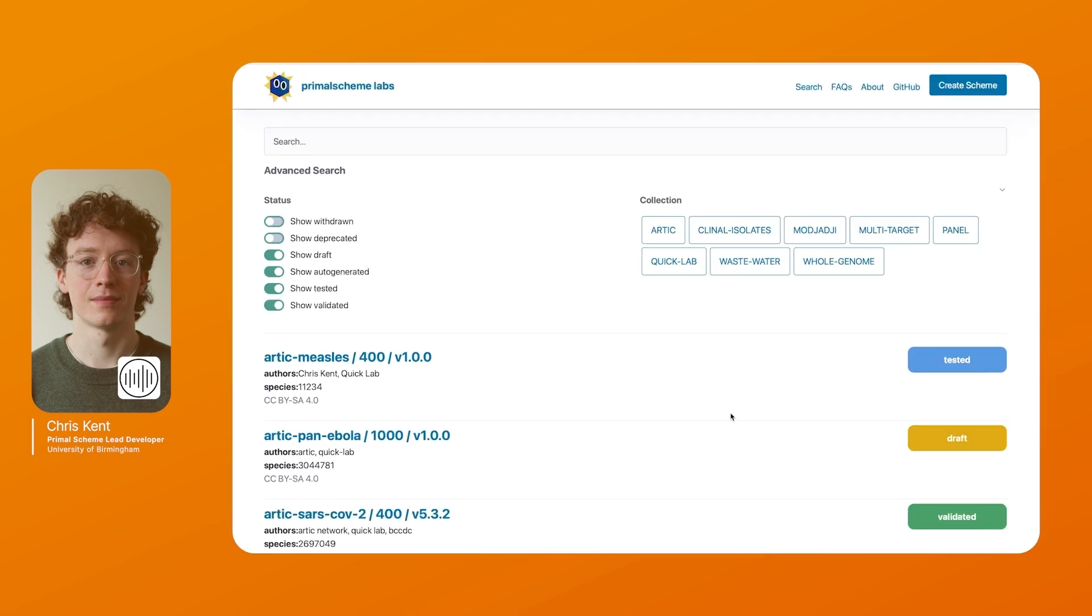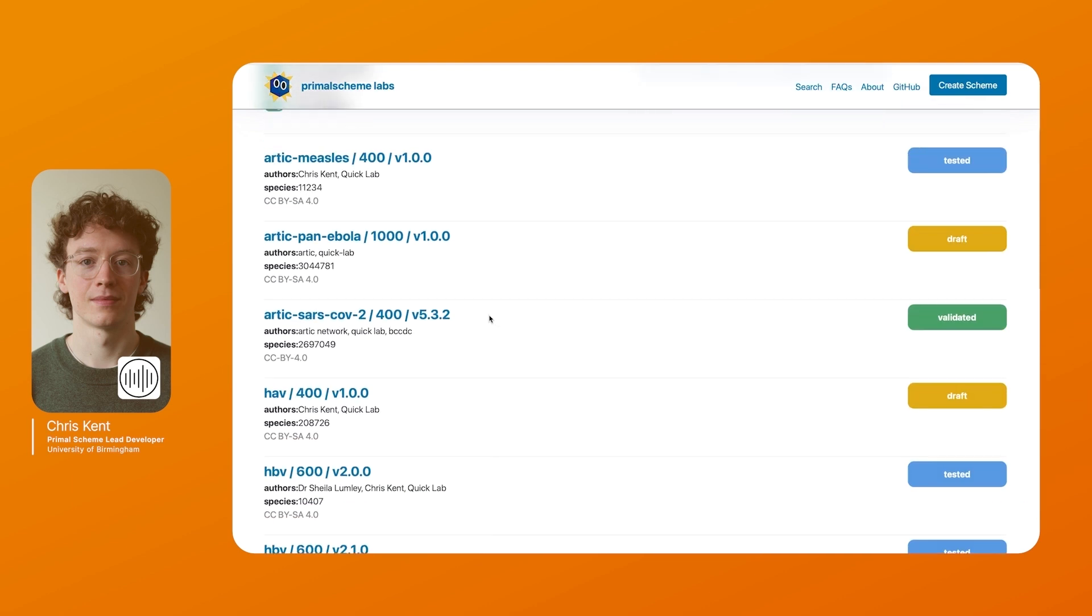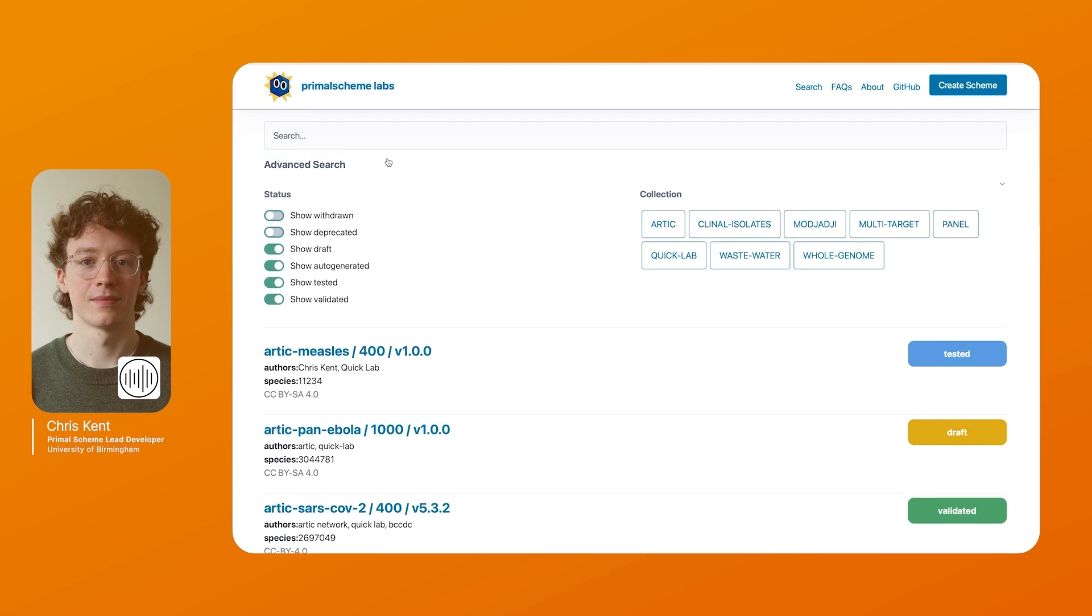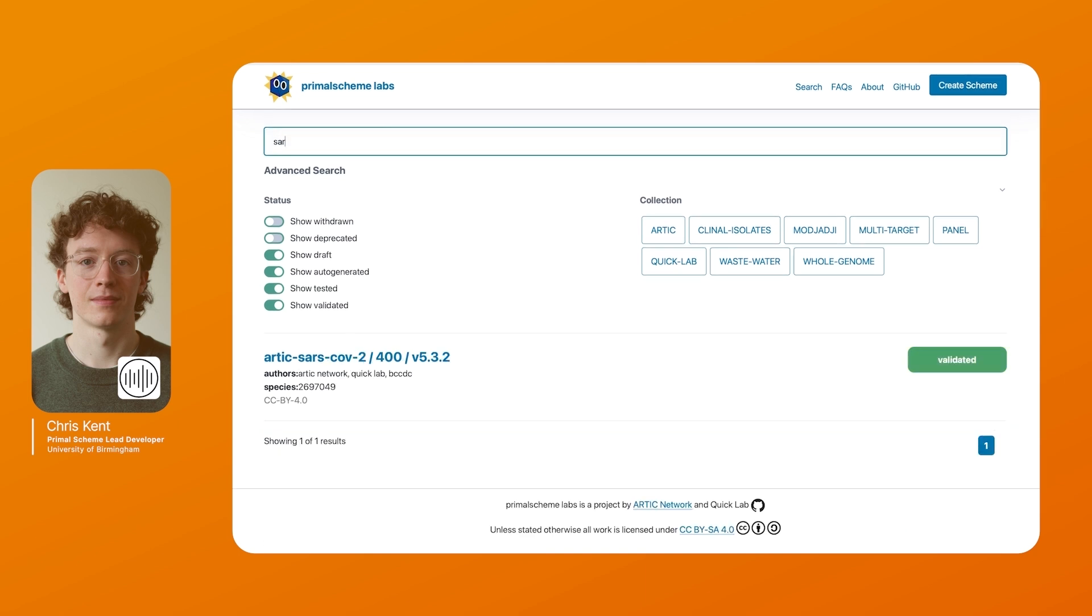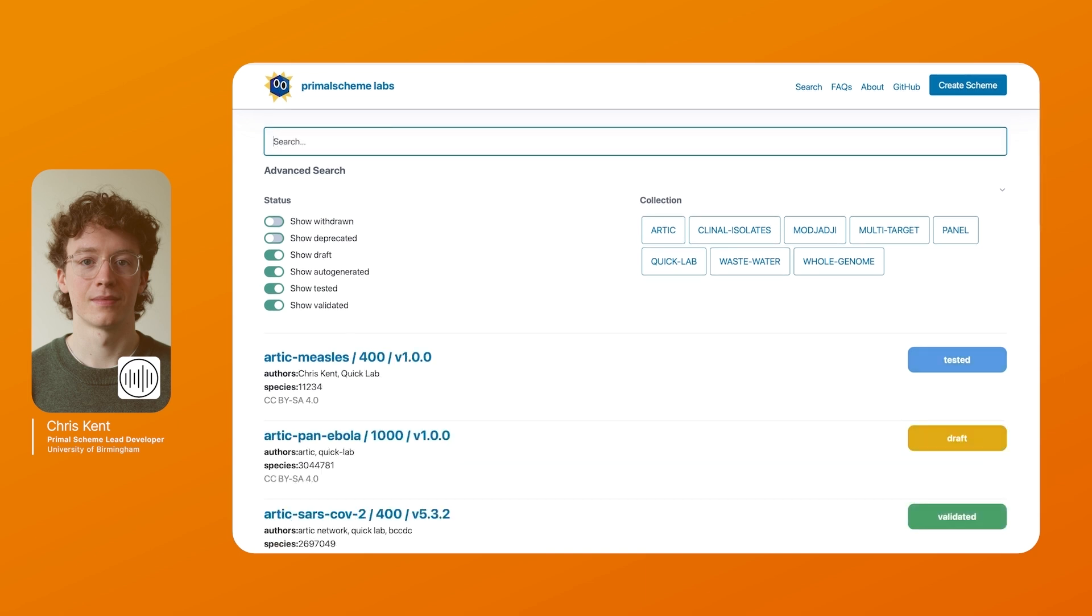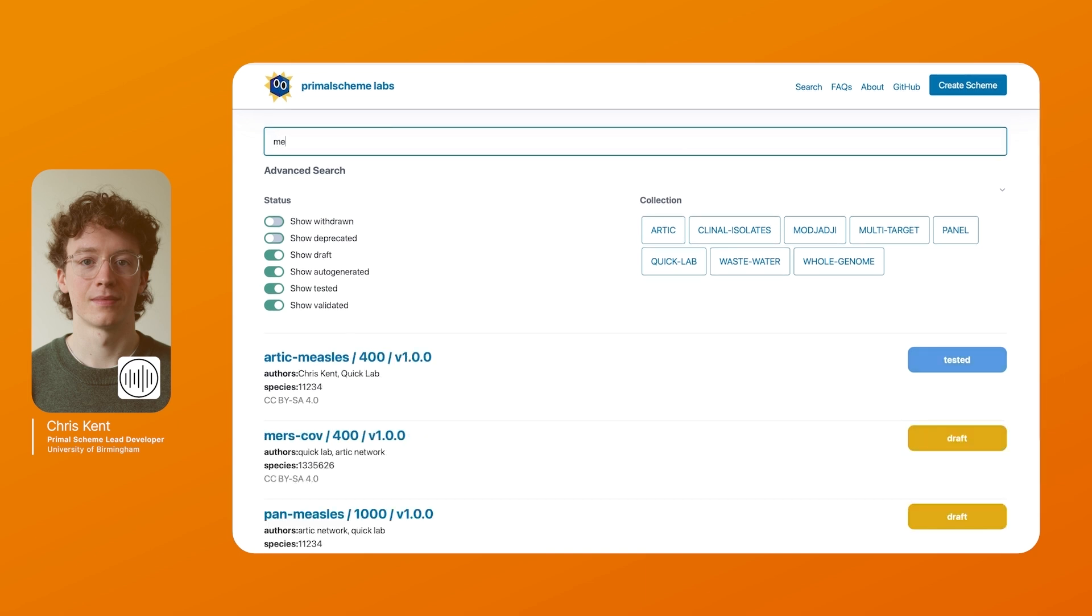So this is labs.primalscheme. This is our open source central repository for schemes which have previously been used or tested. We have a nice collection of schemes listed here and you can search for particular things if you have interest in. If you have COVID schemes, if you have measles schemes, you can find the schemes that are relevant to you.